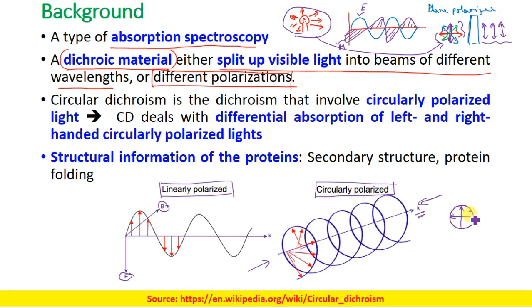and you have electrical polarization in all the directions, so it looks like a circle and has a structure like this. It is because from this direction of the propagation we are getting different movement as the light waves move forward, creating this helical like structure. Otherwise they are moving in a circular motion across the direction of the propagation. Okay, so hence they are regarded as circularly polarized light.